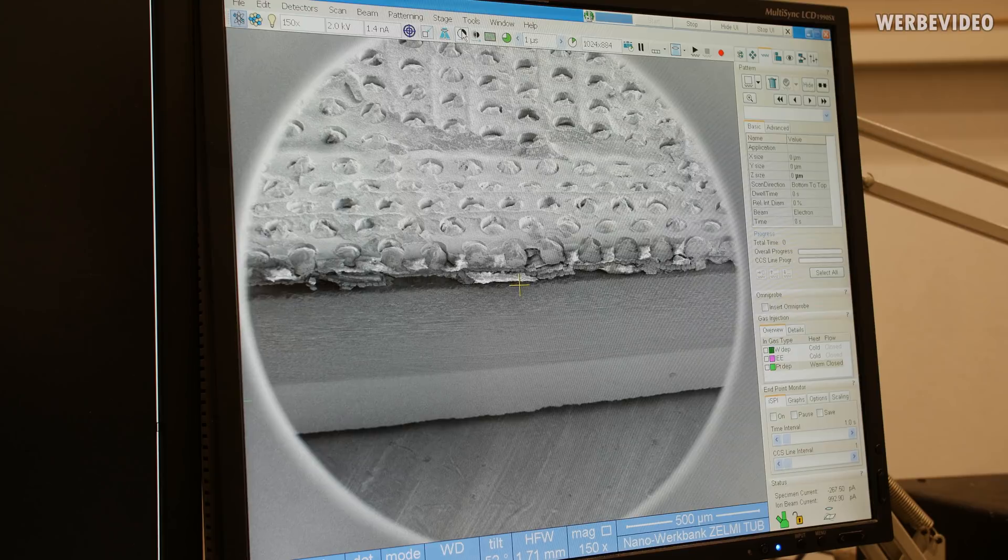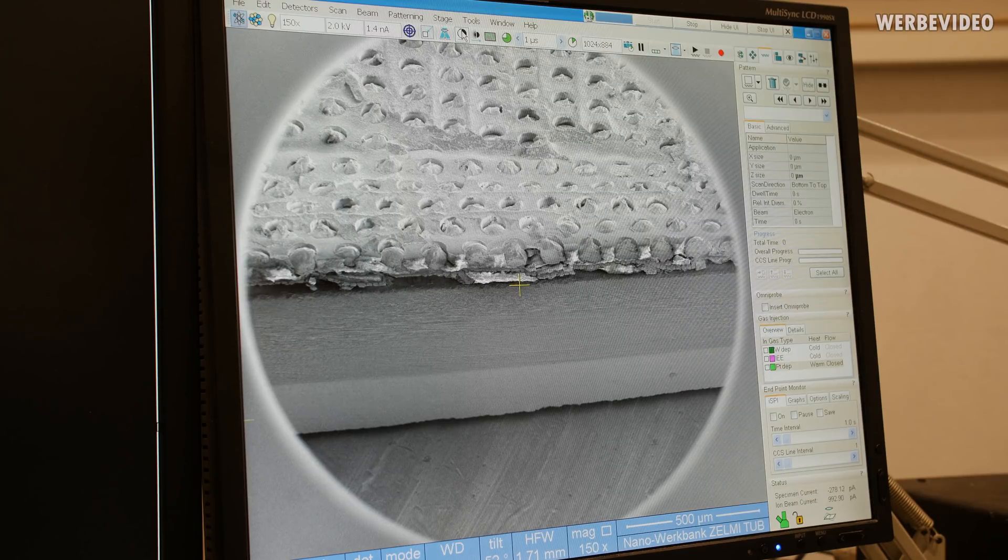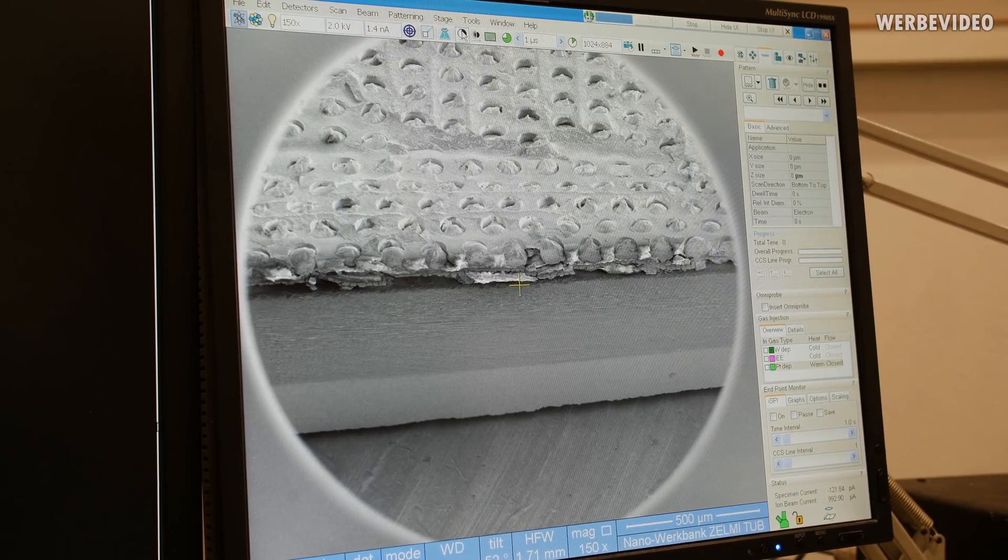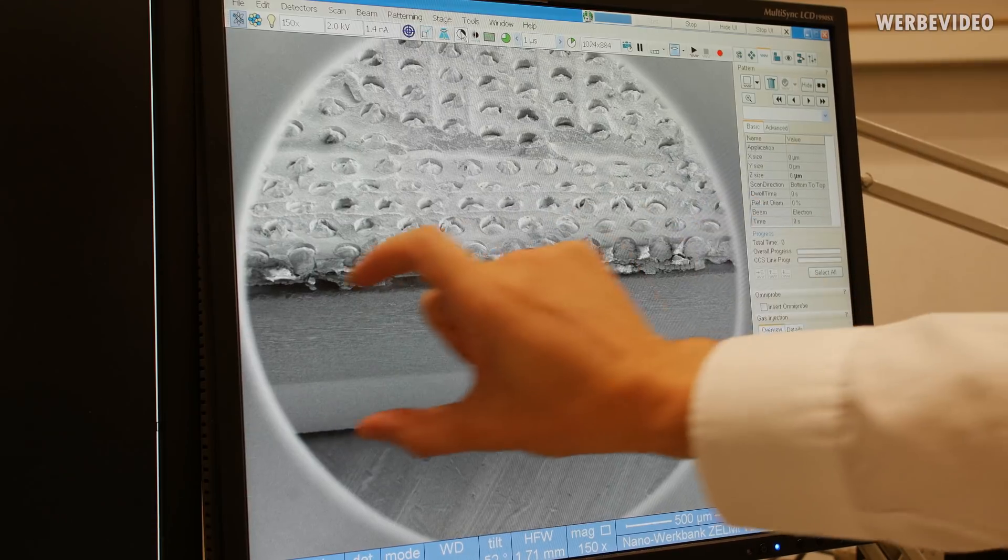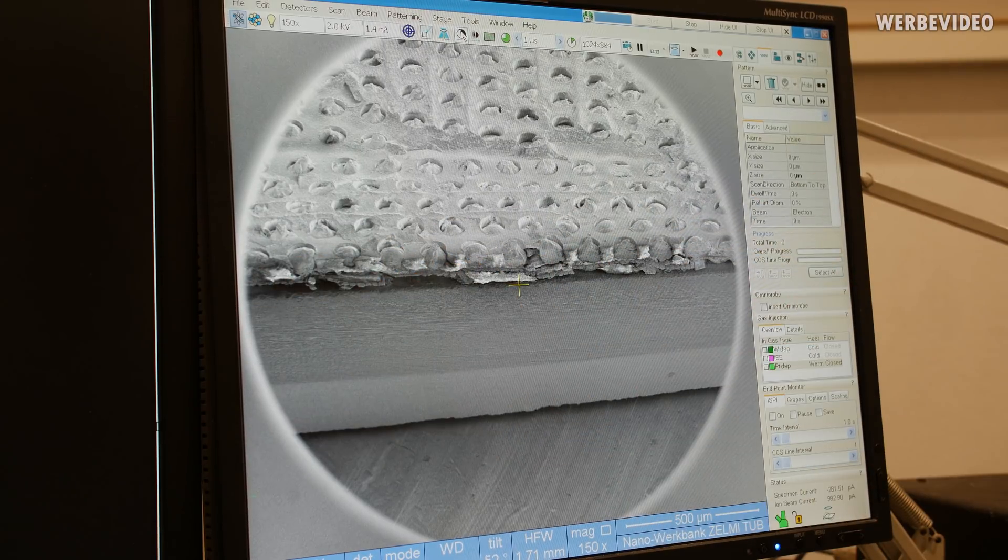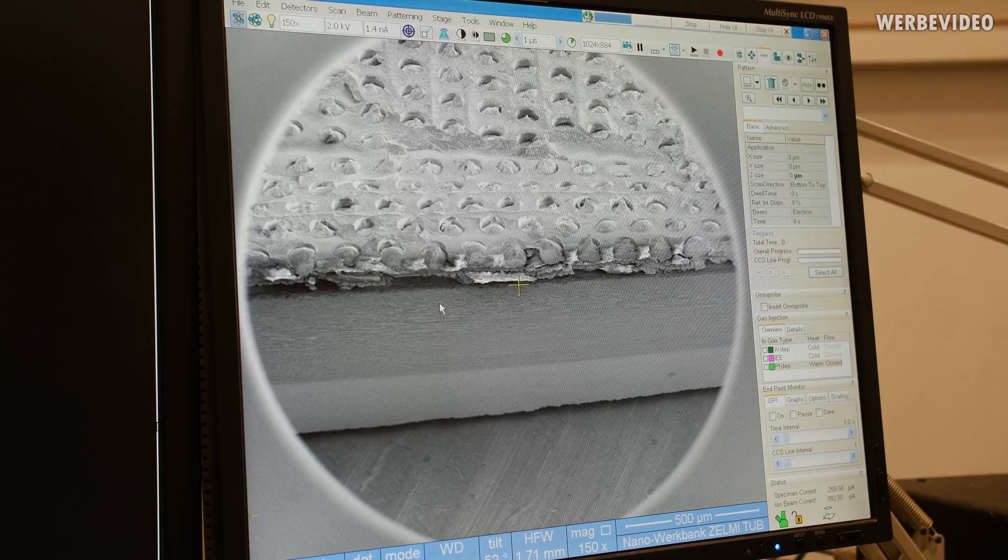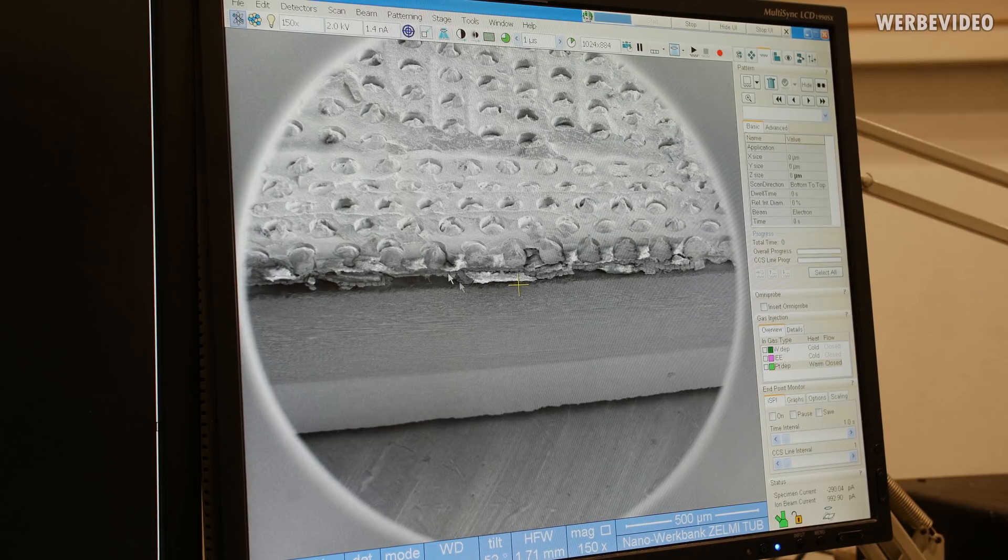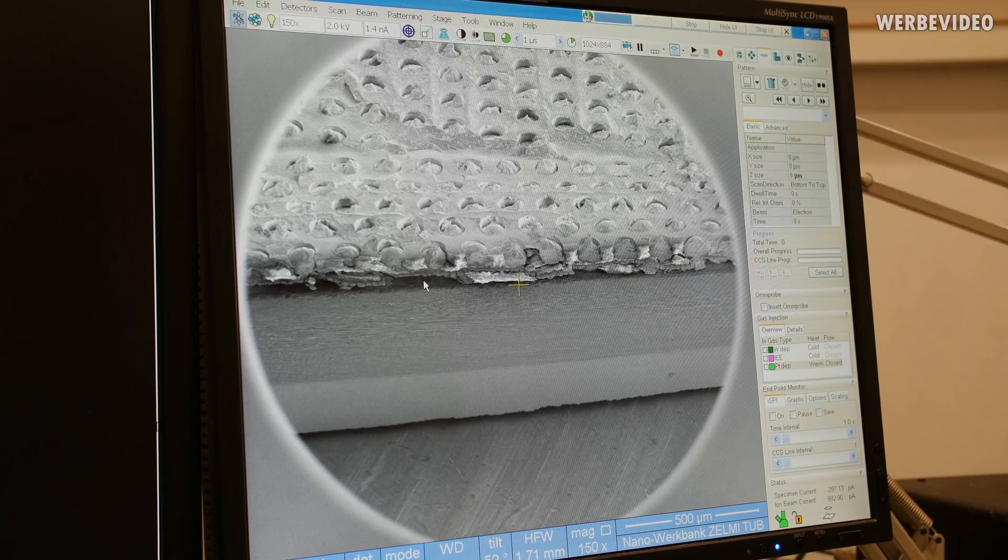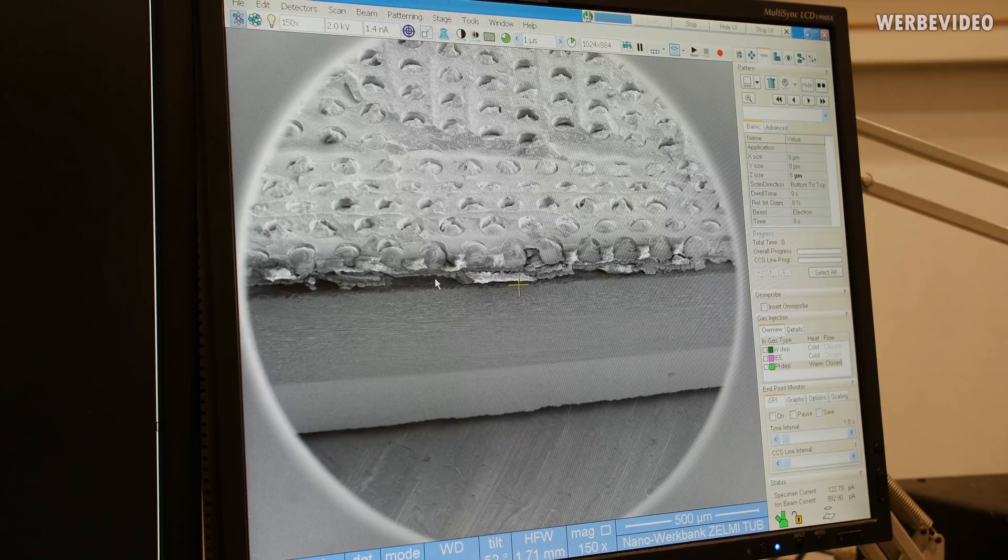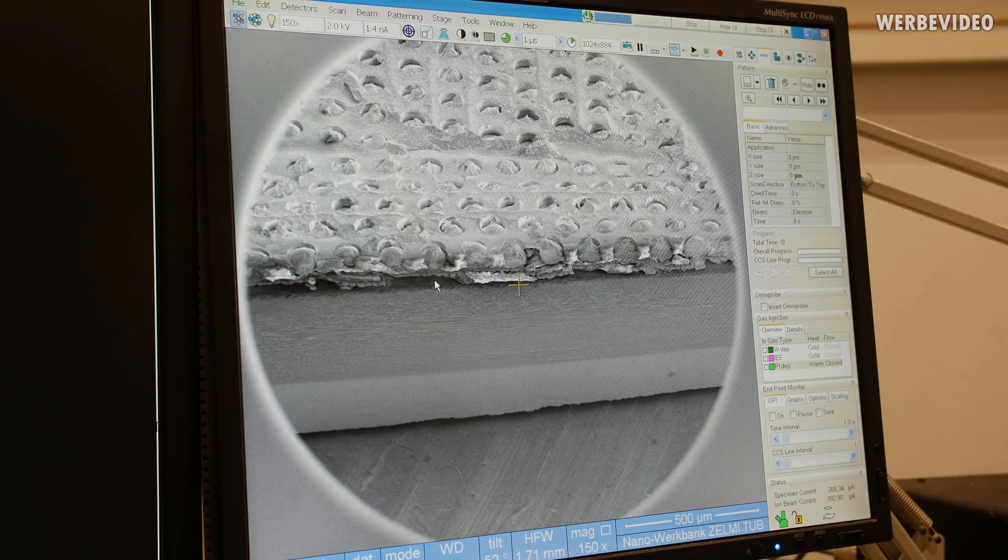Now the specimen is inside of the SEM and you can still see the surface with the solder bumps. Below here this is a silicon wafer and on top of the silicon wafer we have these semiconductor structures that we want to investigate later in the TEM.